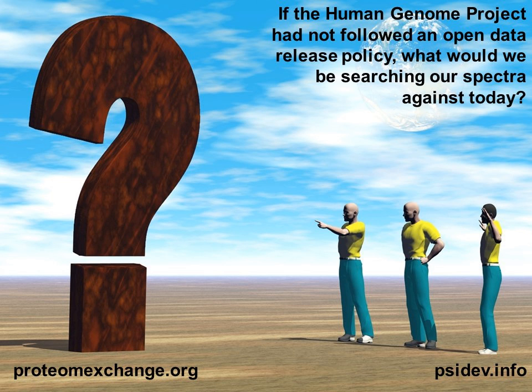But we are already working on the next step, which is building on ProteomeXchange, and that is an API for making the actual data computationally accessible.